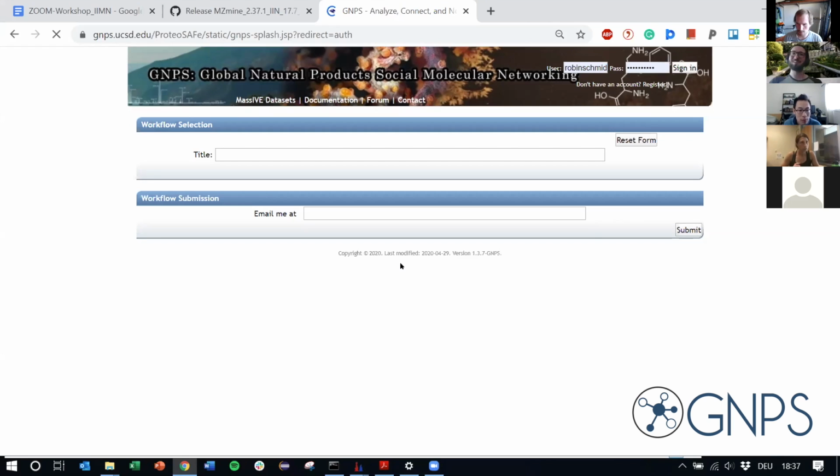And I have to log in. Okay. Oh, it's everywhere.